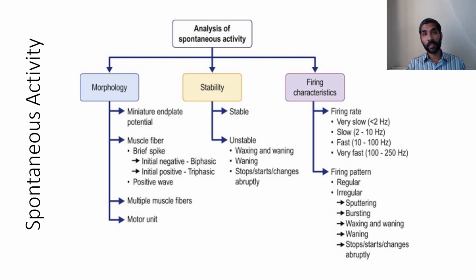And you can also look at the firing characteristics, how fast it is firing. Very slowly, very fast, is it regular, irregular, those kinds of things.